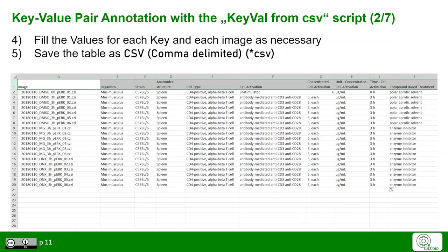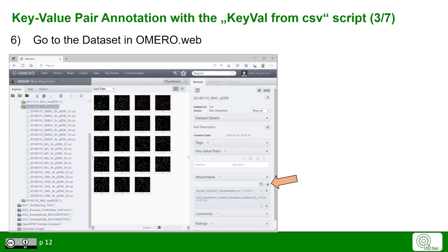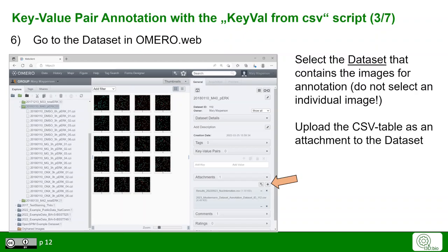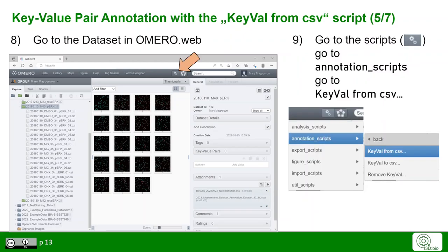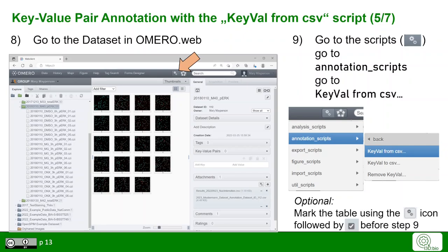Save the table as a comma-separated values (CSV) format. If the correct script is installed in OMERO web, go to the dataset in OMERO web and add the CSV table under the attachments toggle. Make sure you select the dataset for the images and not the individual images themselves. Optionally, you can use the Scripts icon in the attachments toggle to mark the CSV table attachment before the next step.